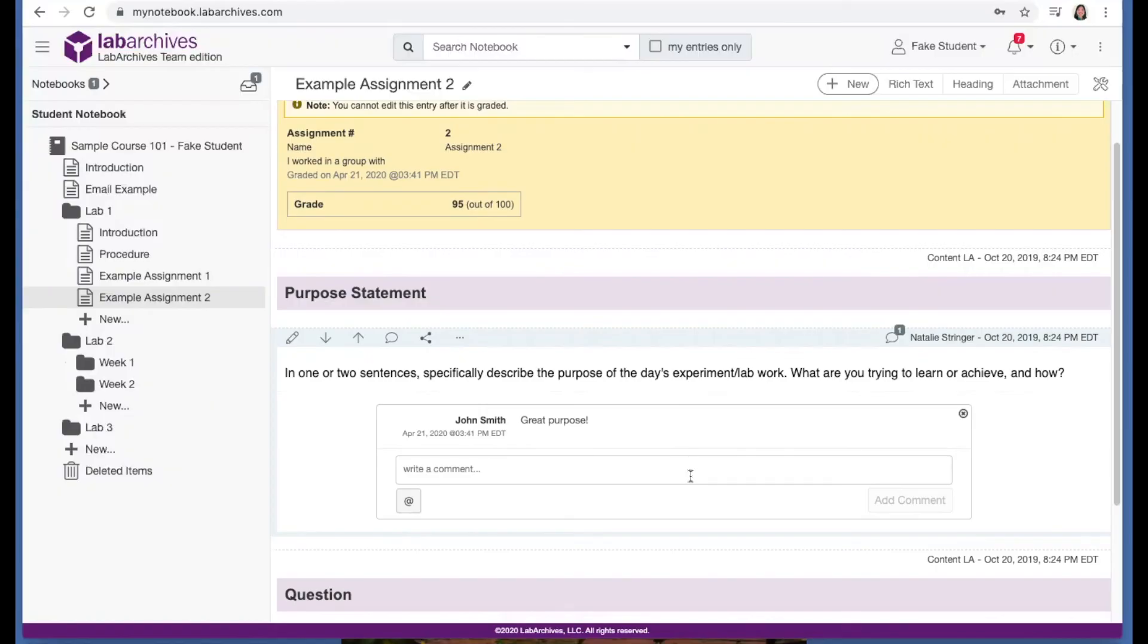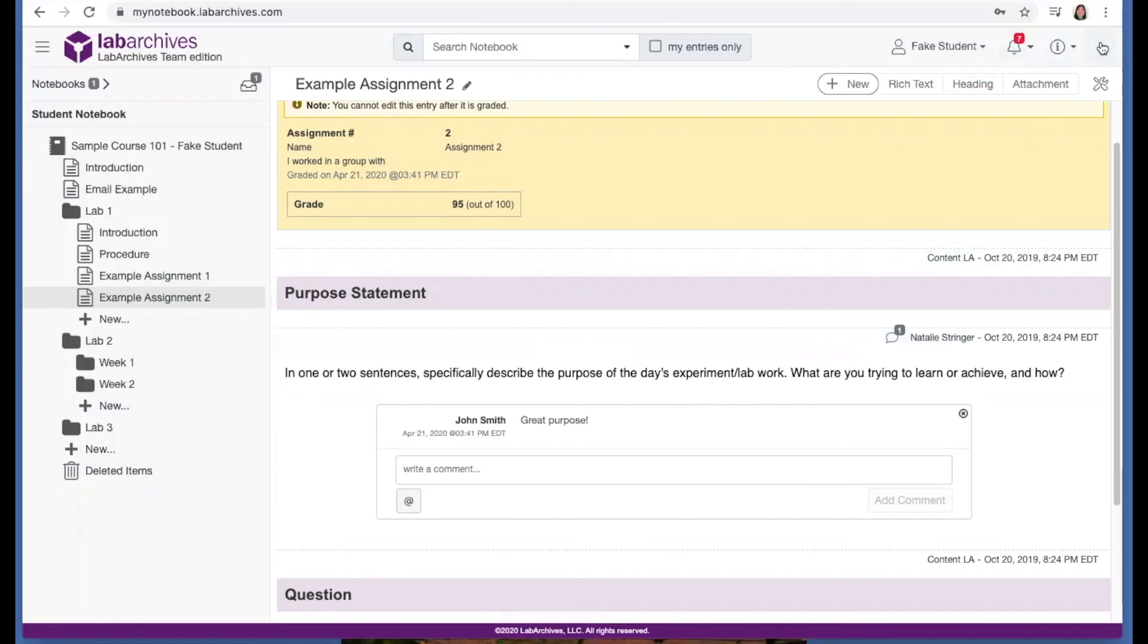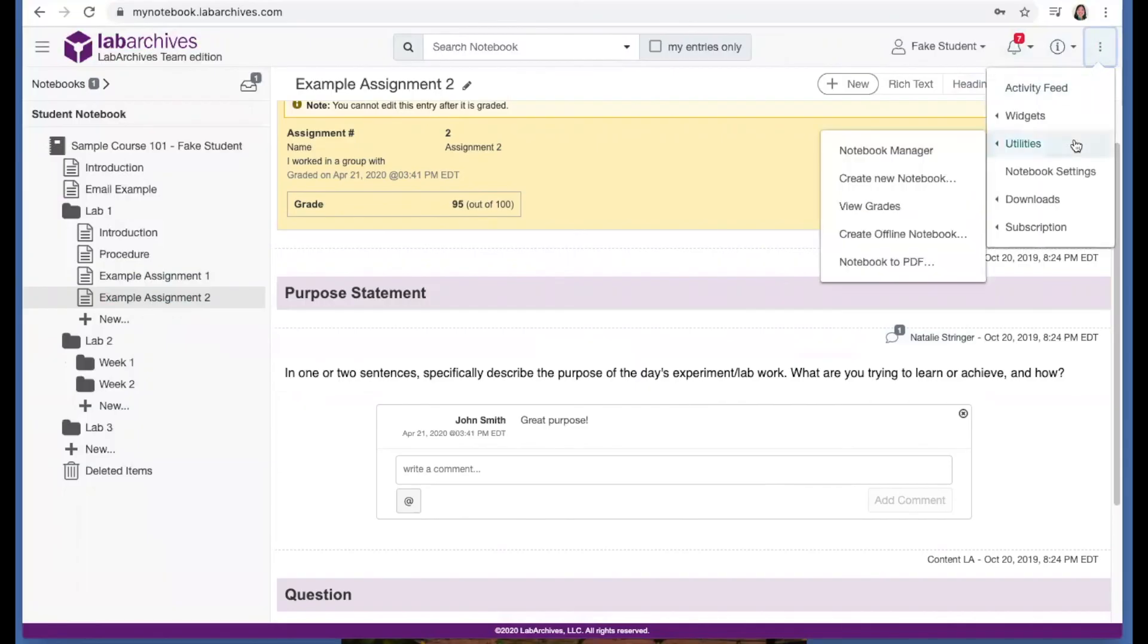At the end of your course, you may want to download your entire notebook to add to your professional portfolio. You can download your notebook by going to the triple dot menu, utilities, and select notebook to PDF.